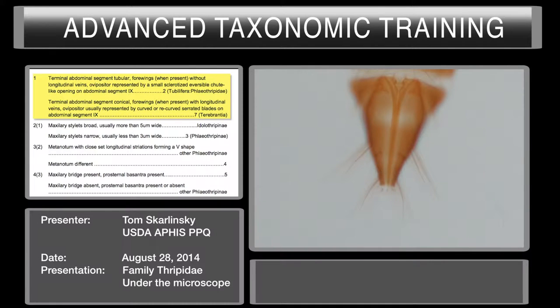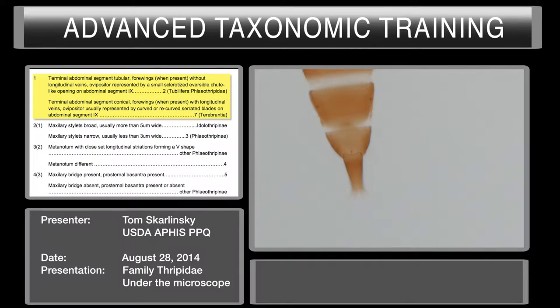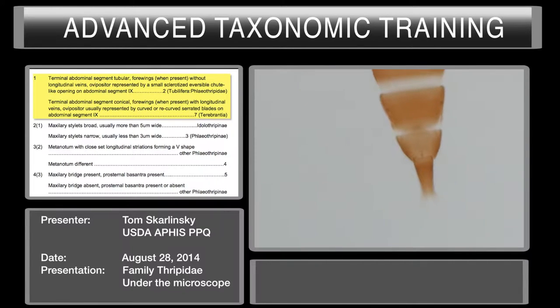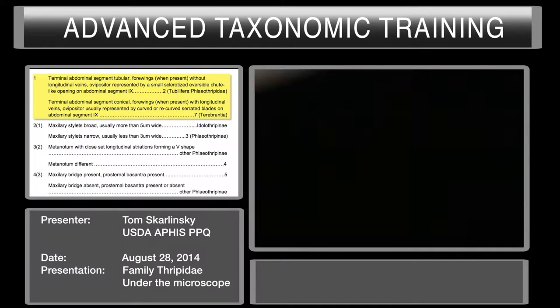You'll notice that there's a gap right up in this area. So in Phlaeothripidae — the Tubulifera — we have the cone, and you'll also notice that there's no slit in it in the center, especially on the venter. So we'll go ahead and focus in on the venter.